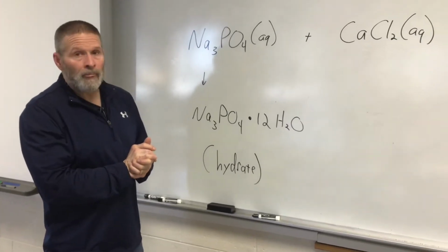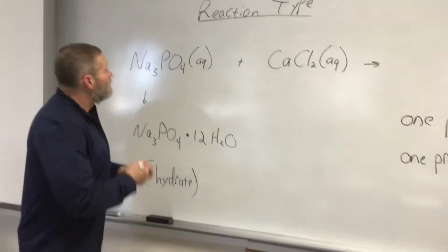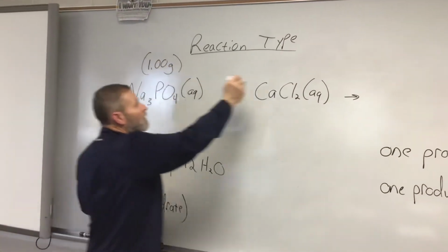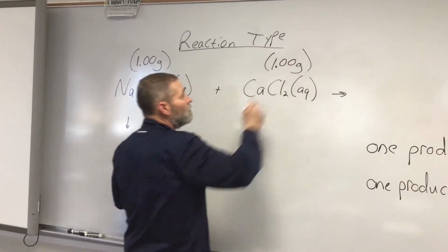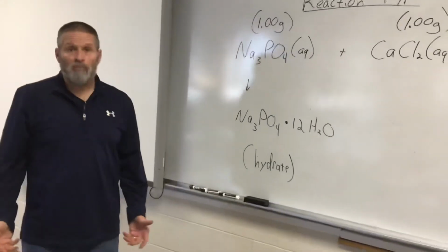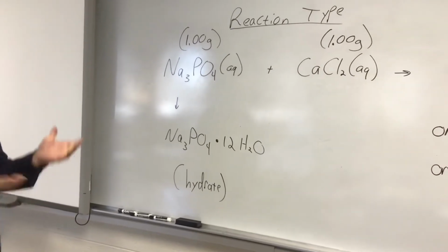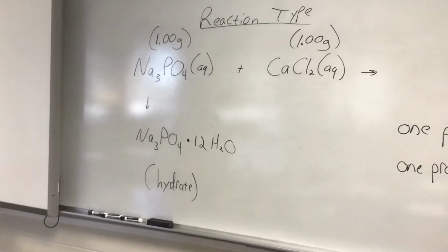So we have measured out 1 gram of each of those two reactants. That's right. You'll see that in a second here. You'll start with 1 gram of each of these. Okay. So now limiting reagent will be important. You're mixing amounts of two different things here. Somebody's going to run out first. You're going to have to decide who that is. Yep. Ultimately.